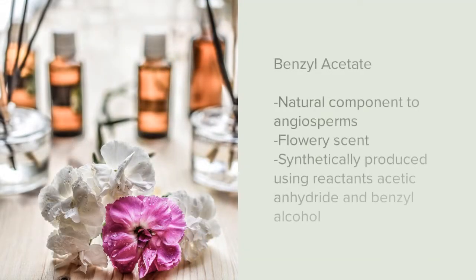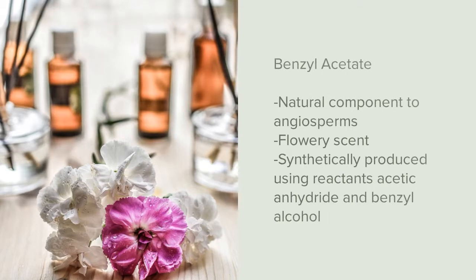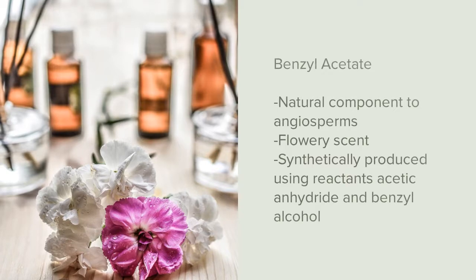Benzyl acetate is an ester that is naturally occurring in many flowering plants and can be synthesized in the lab using the reactants acetic anhydride and benzyl alcohol. It can be used as a food additive, flavoring agent, and odor agent as a result of its flowery scent.